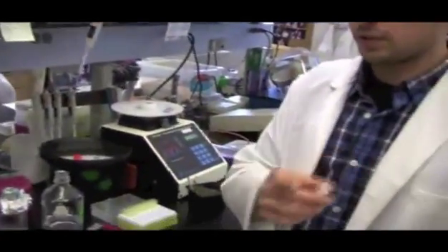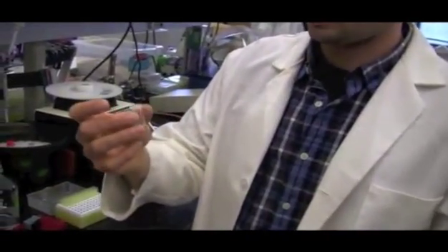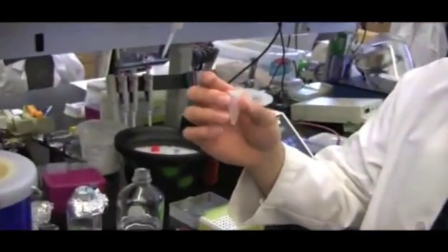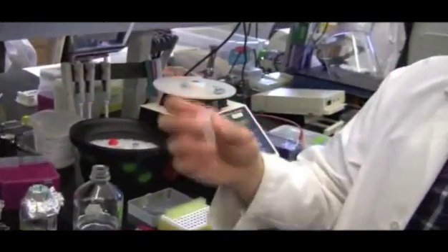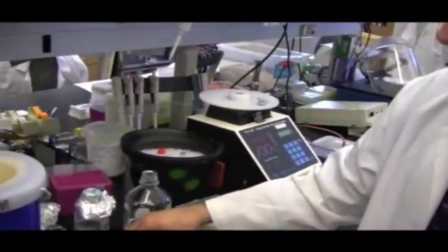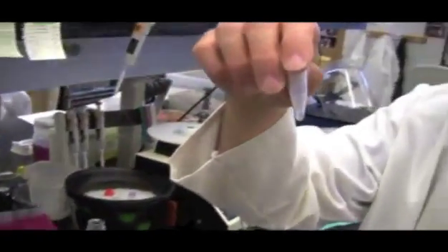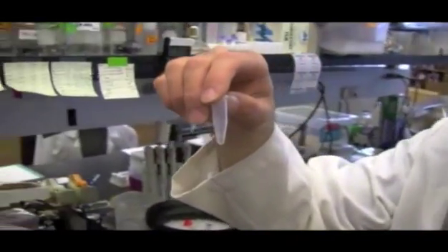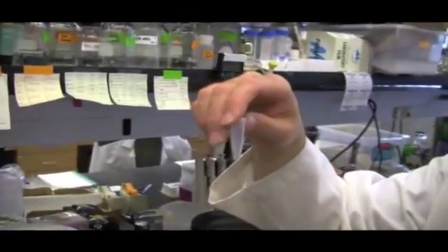Okay. So if I just extracted the DNA out of all that plant material, what's left over in the tube? I think that's one of the questions on your guys' worksheets. Cool. Okay. So this still has some other stuff in there, and so it needs to go through a couple purification steps, and conveniently I did that earlier today also. And so this is what you end up with. There's this tiny little speck of liquid that has all the DNA that was in that plant tissue or within the cells that we just ground up in that mortar and pestle in the liquid nitrogen.